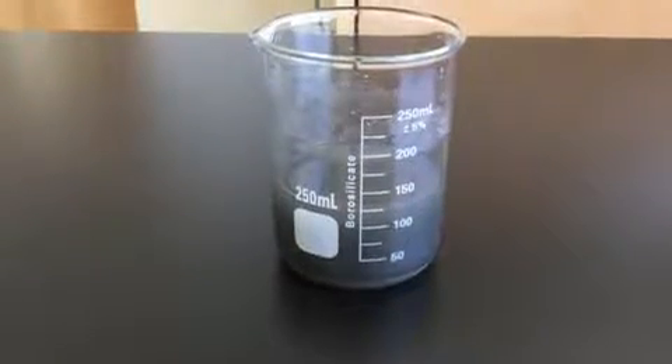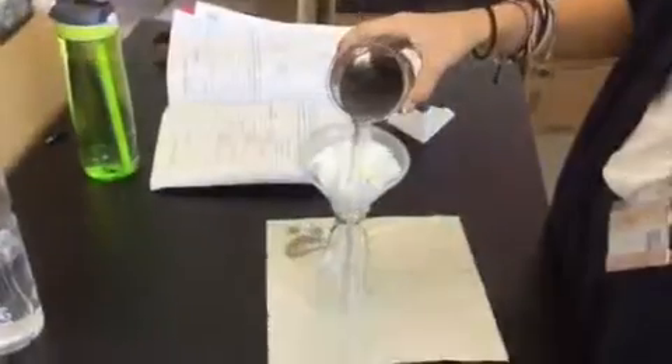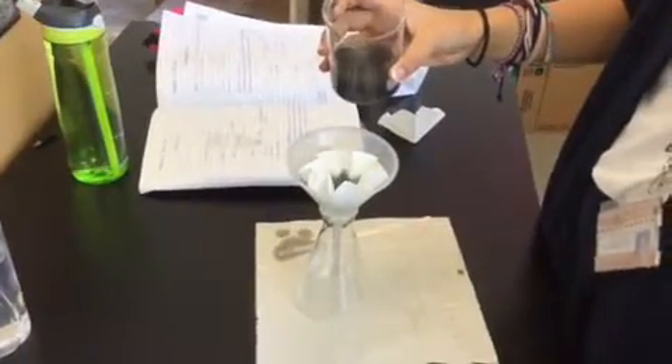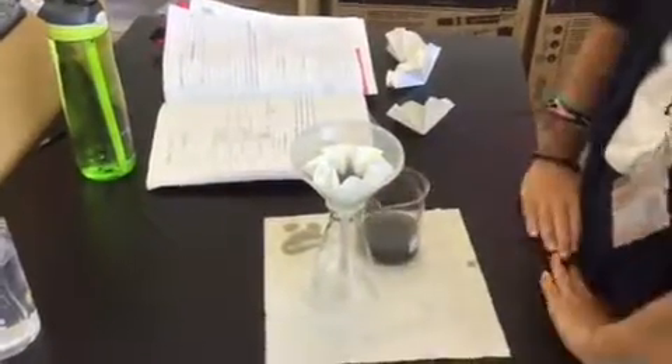The aim of this task was to separate this mixture and collect a sample of the four components. The first step in the process of separating the mixtures is filtration. We used a filter, filter paper, conical flask and a beaker.